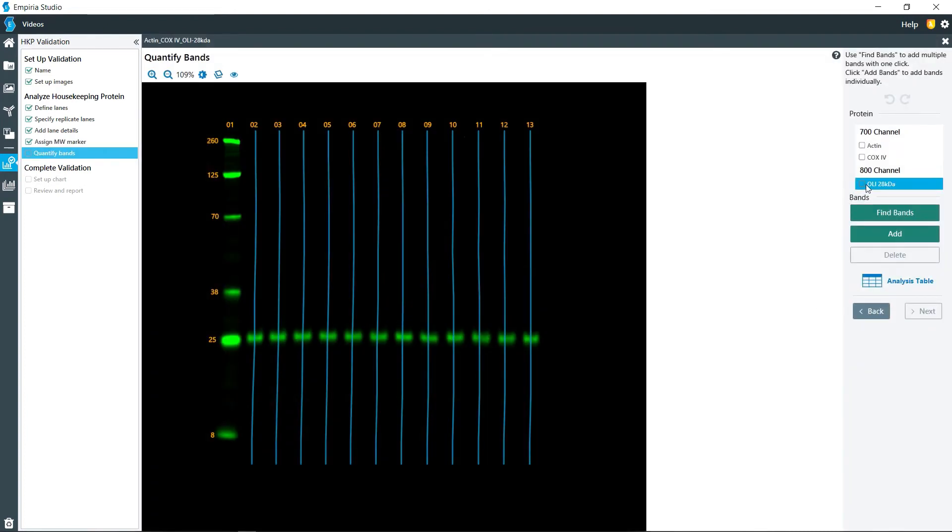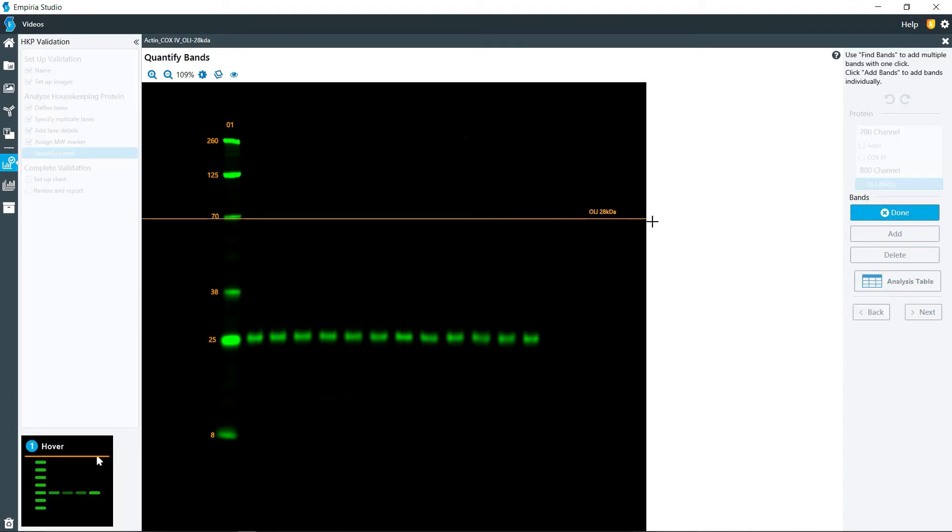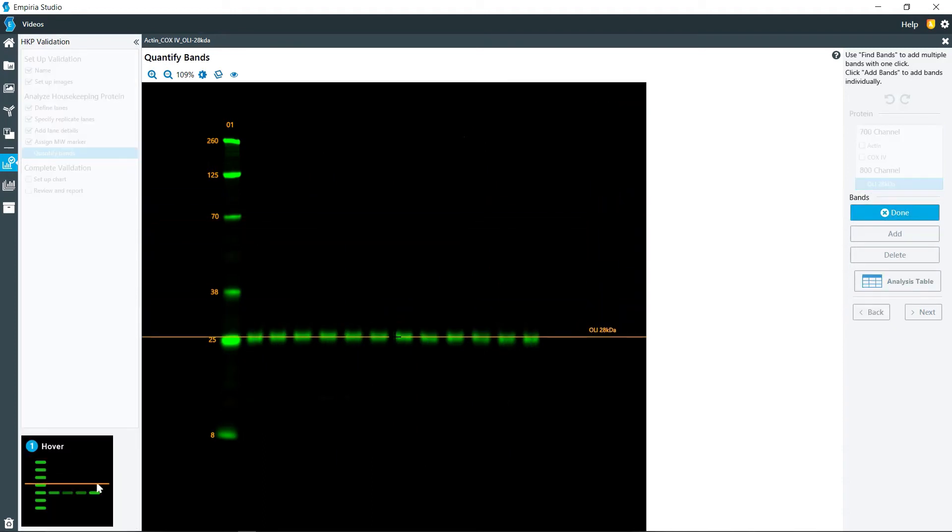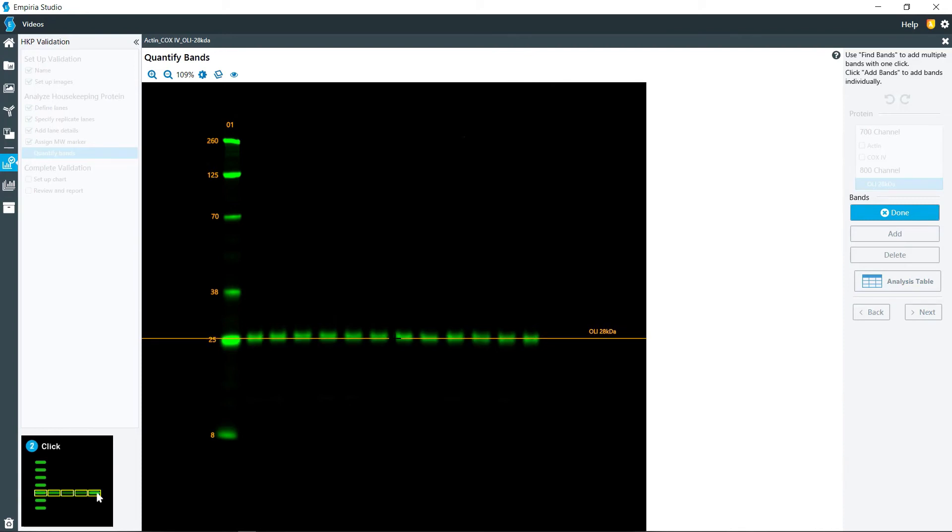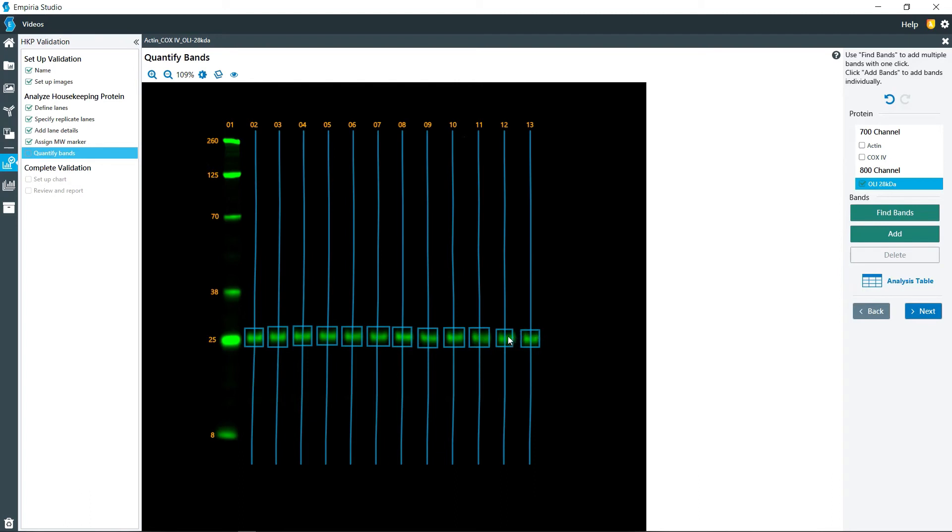So quantification, here for my Odyssey loading indicator, I'm going to click on find bands and position that line as best you can. Then if it needs any manual adjustments, you can click on the individual band markers and make those adjustments as needed.